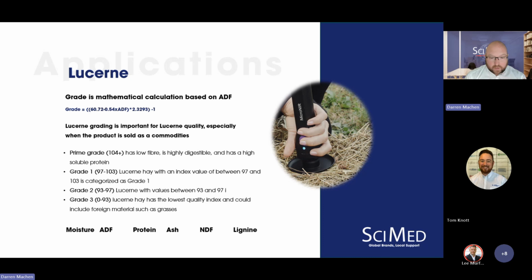That enables your customers, or you guys, to make decisions quicker based on results that are fit for purpose. Yes, it may not be as accurate as the lab-based method, but as Tom alluded to, if you have to digest samples, clean them up, and wait for the results, you need a decision to the nearest percentage now, not to the nearest ppm in 2 weeks. So there is definitely a need for these types of devices.